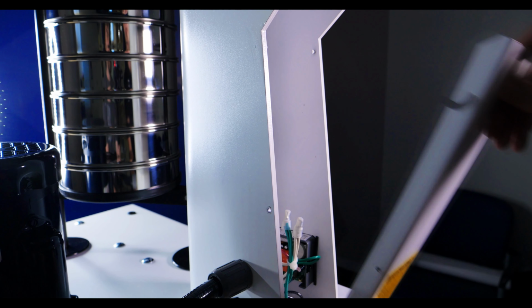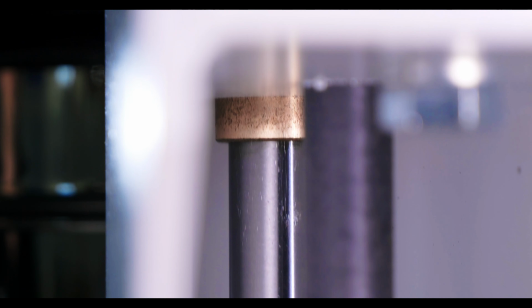We like to say that during the first year of using a brand new Ro-Tap, you shouldn't need to change out any parts. Some oil can be applied on the parts that are rubbing, but it should work pretty smoothly. After a prolonged period of use, you may start to see some of the major parts start to show some wear and tear.